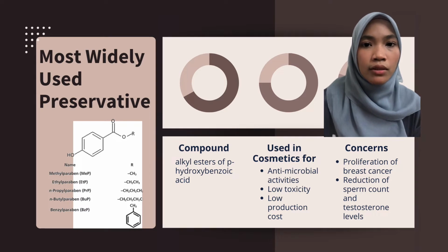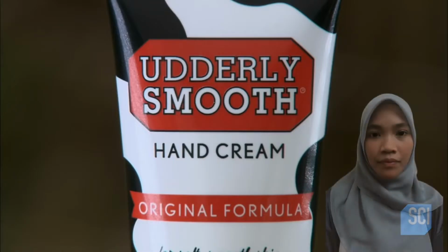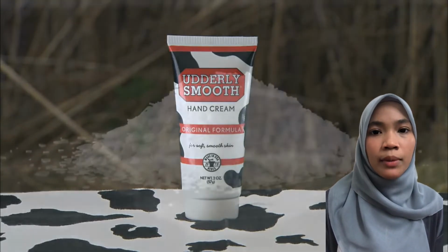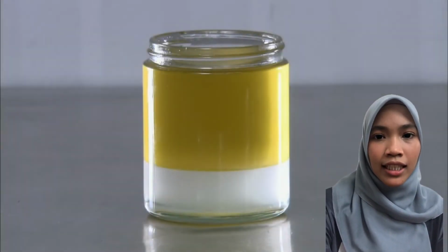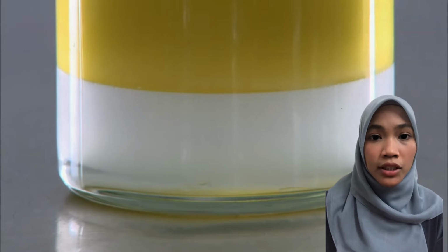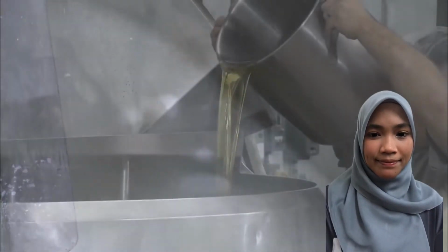Therefore, accurate methods to determine the levels of these compounds need to be available for monitoring preservative concentration in cosmetic and personal care products. The most frequently used technique in preservative analysis is high-performance liquid chromatography (HPLC). A reverse phase is typically used with gradient elution by a mixture of water and organic solvent. Gas chromatography and capillary electrophoresis have been reported much less frequently, and single determinations have been made using spectrophotometric or photometric methods.